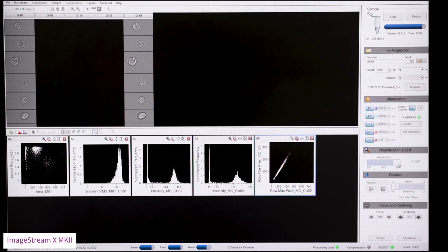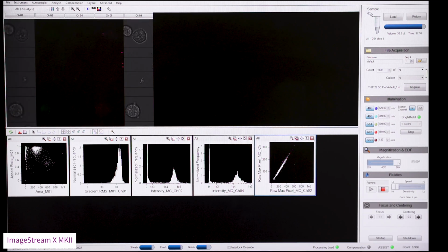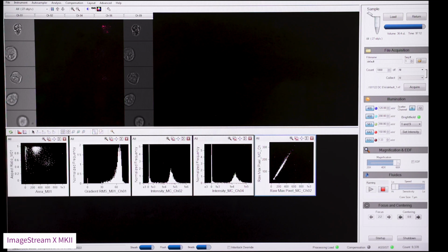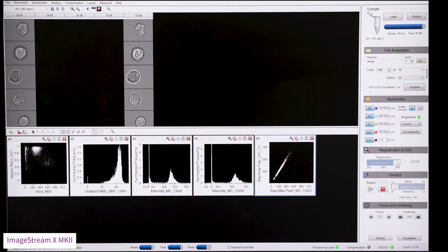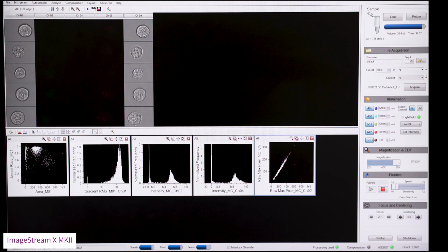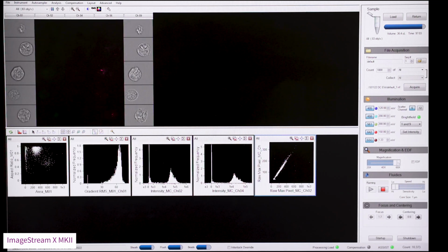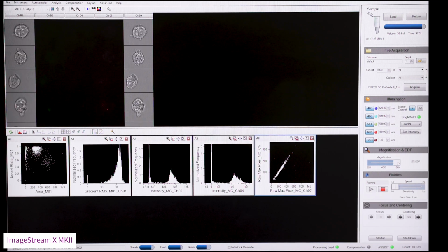You should note that the 60 times objective is the slowest, and samples take 3 times longer than the 40 or 20 times objectives. It is possible to increase the speed, but this causes the loss of resolution as the machine starts to bin pixels together. Therefore, in most instances, we run the machine on the slowest setting for the objective. For this sample, the 60 times objective seems acceptable.